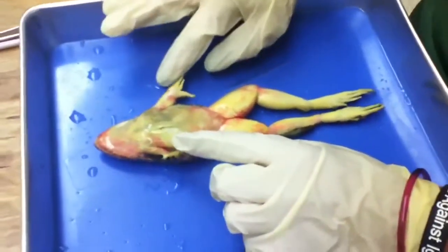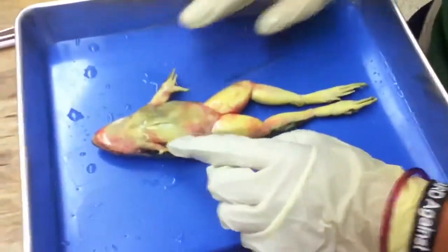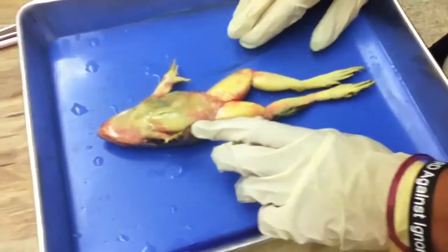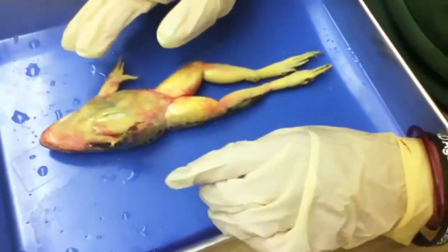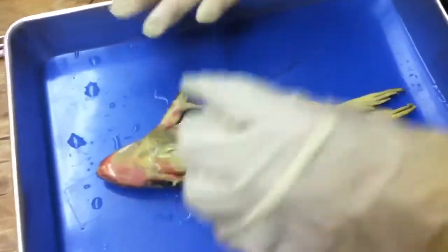I'm so glad that I cannot smell anything. Now, we got a group of 4 over here and a group of 2 over here. Make a decision, or I'm gonna make it for you guys. One of you needs to move and do it now. Okay, what's next? So male frogs are usually smaller, and it's got big hands. What's next?